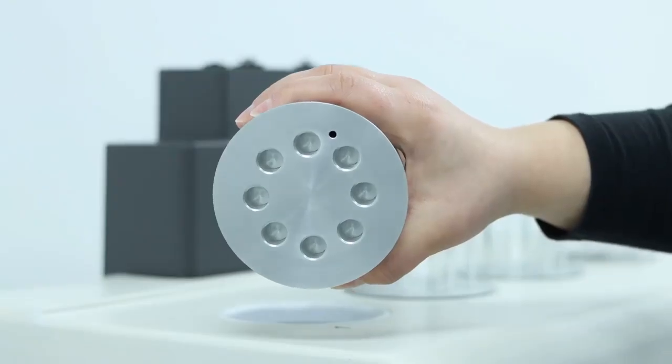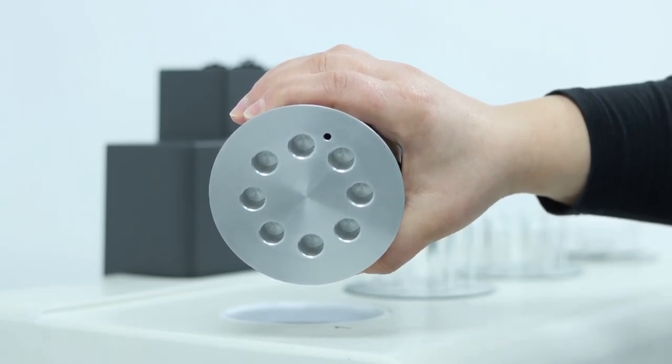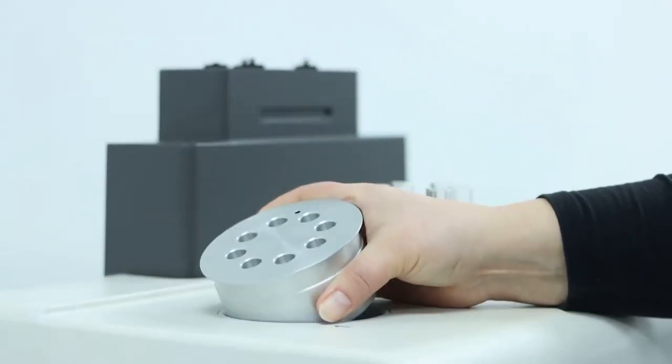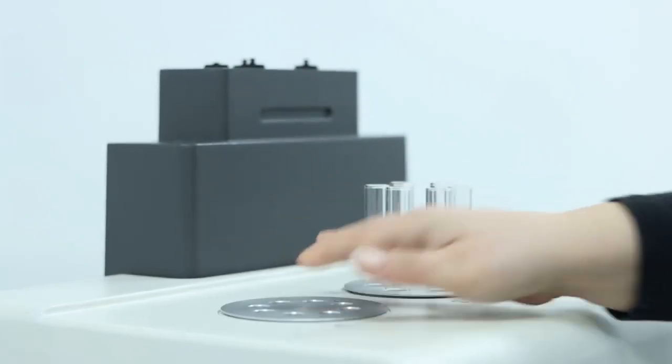You can use your own tubes and vials as long as you have the right aluminium insert. And if we don't already have an insert for your usual tubes and vials, we can do custom ones.